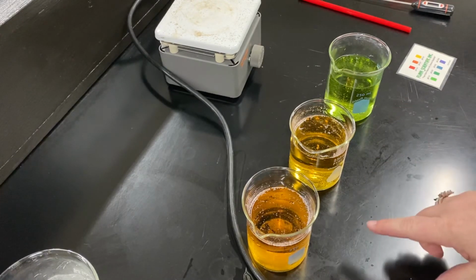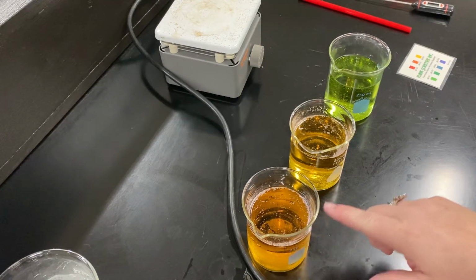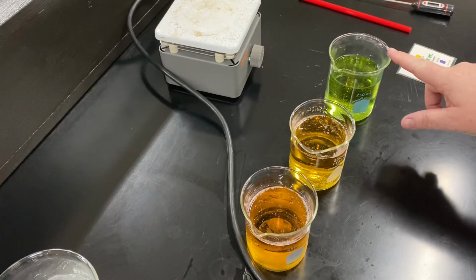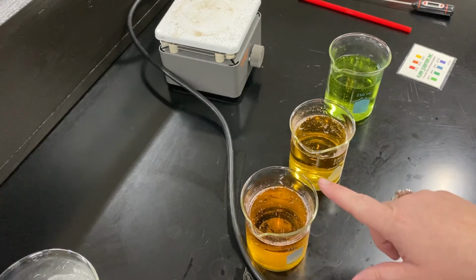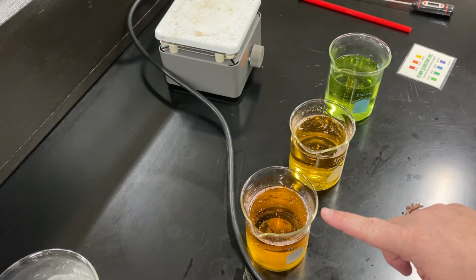So what we're seeing is that this has a lower pH. This means that this has more acid in it than this does. So that means this has more carbon dioxide gas in it because it made more of the acid. This is a very simplified explanation.